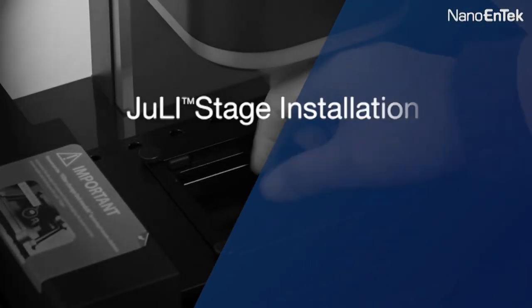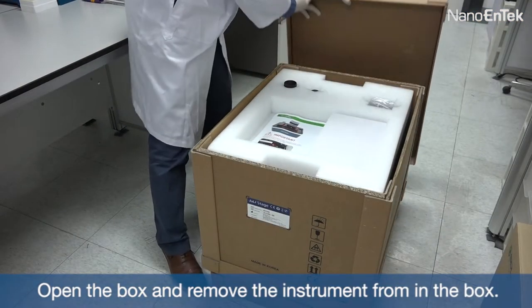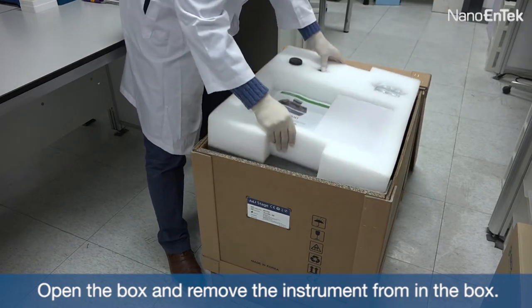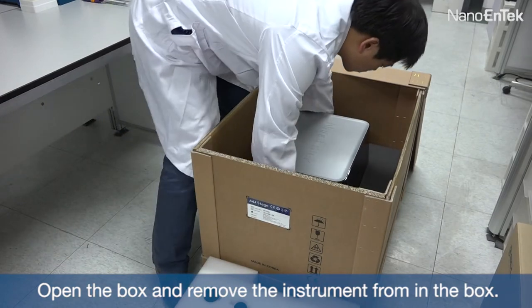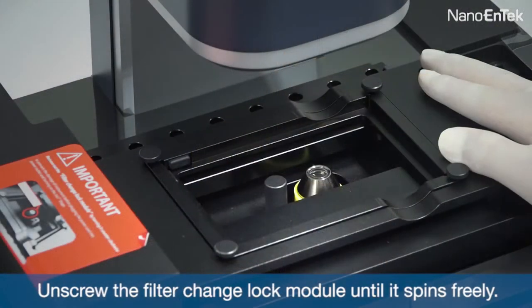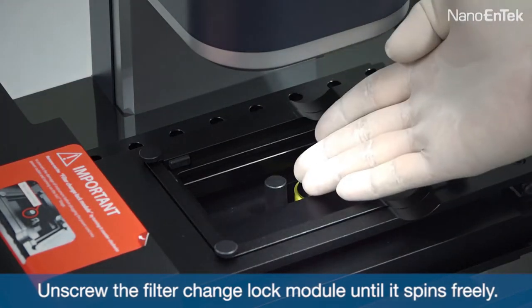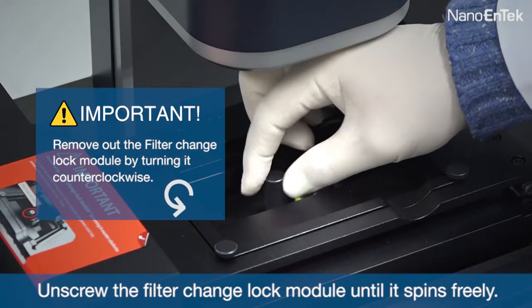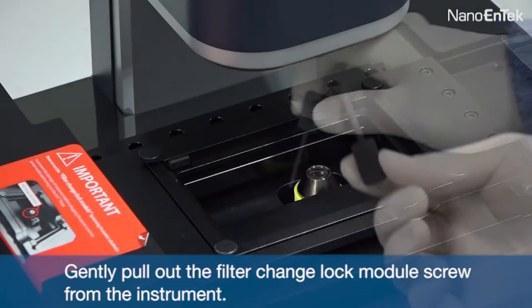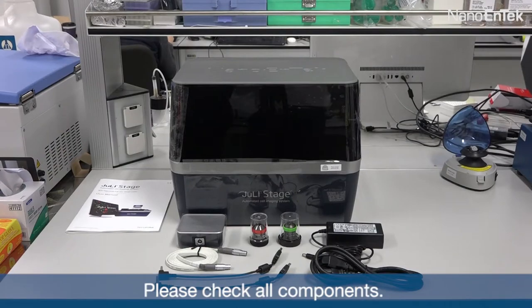This video will show you how to install the JuliStage. Open the box and remove the instrument from the box. Unscrew the filter change lock module until it spins freely, then gently pull out the filter change lock module screw from the instrument. Please check all components.